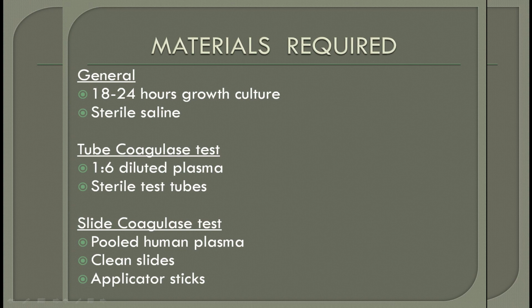So, 18 to 24 hours growth culture. This means growth culture, so that obviously means that you're talking about the bacteria. So you need an 18 to 24 hours growth culture of the bacteria, and you need a sterile saline. You know, saline, salt water? Sterile it has to be. Why do you need saline? This is because I had talked about this earlier.